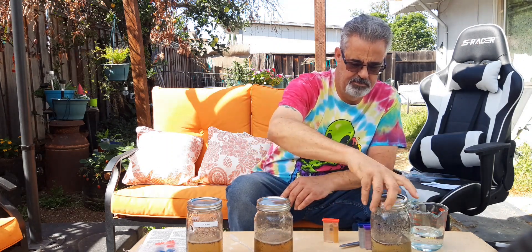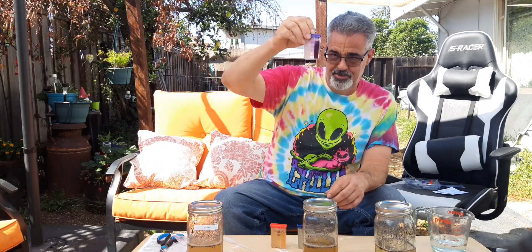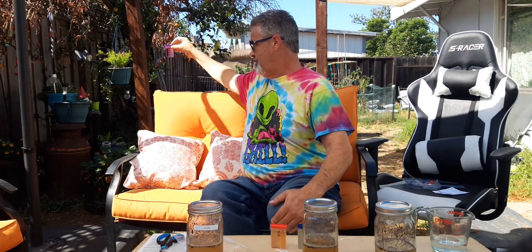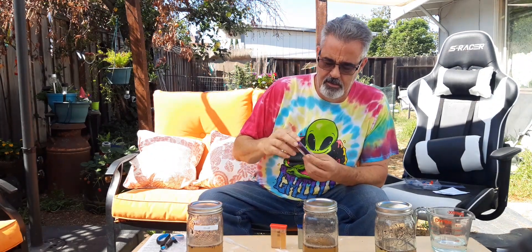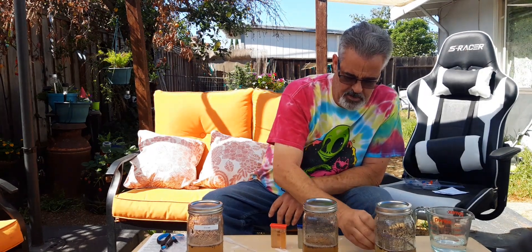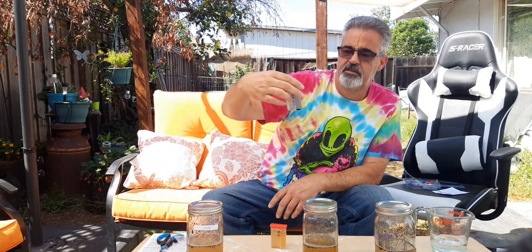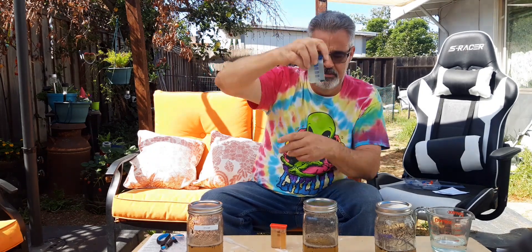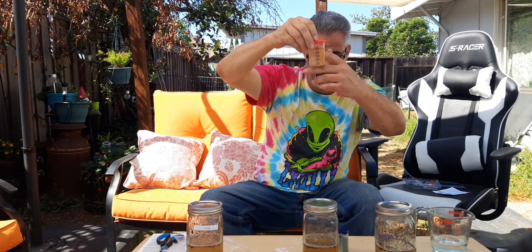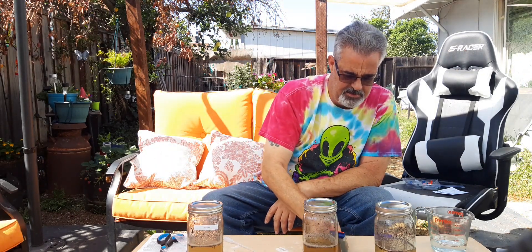Alright, we've got the results for the Jelly Rancher. This one again has a definite surplus of nitrogen. The phosphorus — we are depleted. And the potash/potassium — we are also very nearly depleted, between deficient and depleted. So again, it ran out of nutrients for flower.